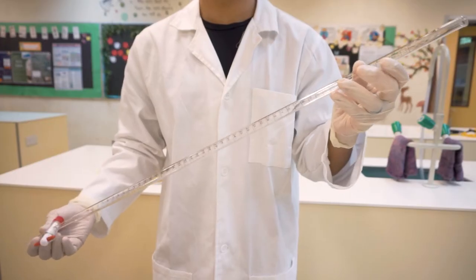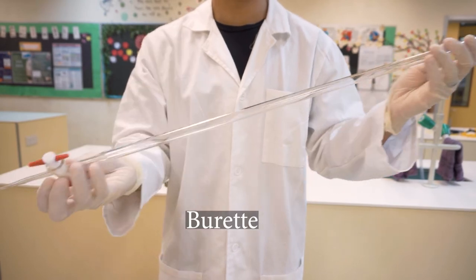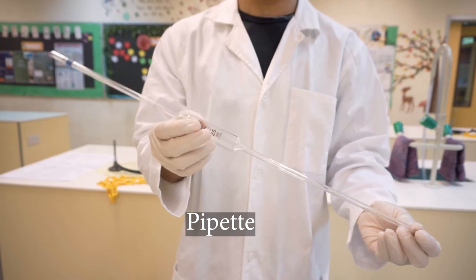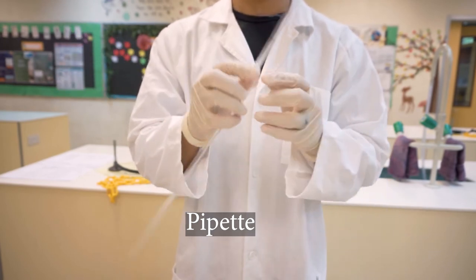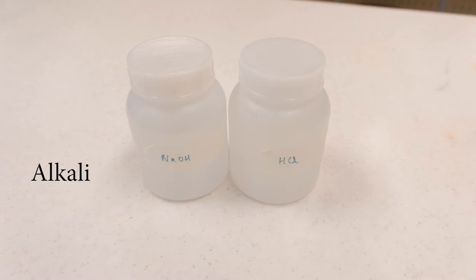First and foremost, you will need a burette which is usually 50 ml, a glass pipette which has a fixed volume of usually 25 ml. You will need an acid and alkali.